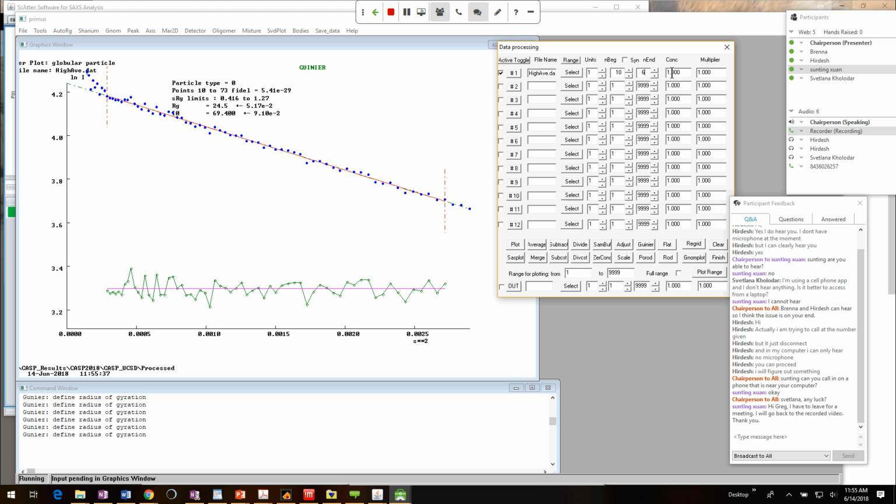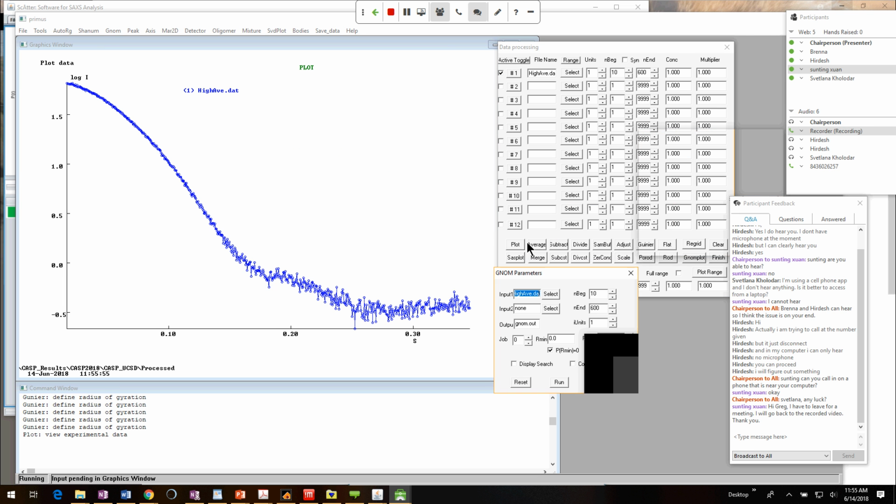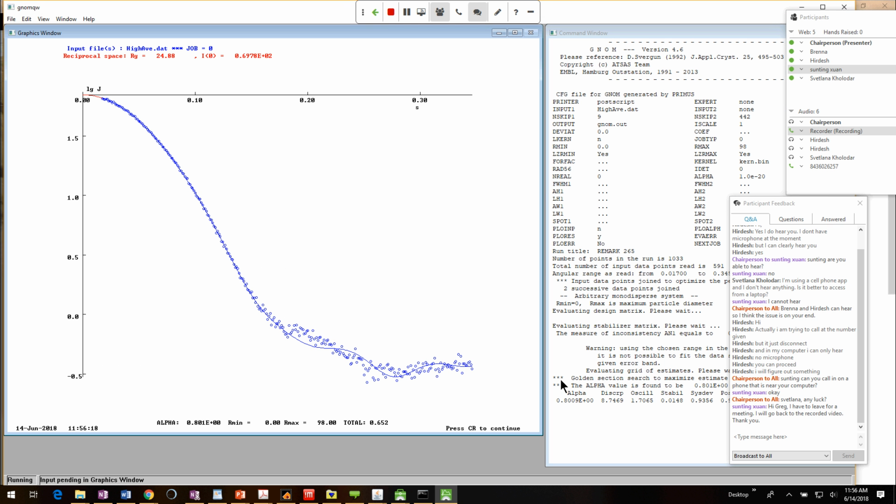I'm going to hit 600 here again, plot, and then I'm going to use GNOM. Be careful with how you name GNOM. It'll overwrite every time. There is an auto GNOM as well. But I noticed the particle somewhere around 98 angstroms, and I'm only going to use the 600 points. 98 here. I'm going to hit run. I get a fit to the data. You can see that the fit with 98 angstrom Dmax is poor, so it doesn't like this.